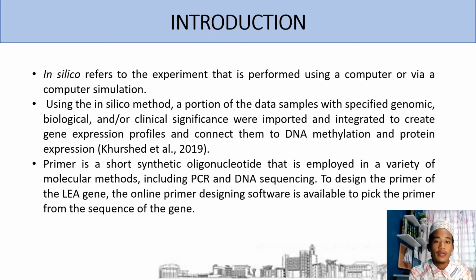How about primer? Primer is a short synthetic oligonucleotide that is employed in a variety of molecular methods, including PCR and DNA sequencing. To design the primer of the LEA gene, online primer designing software is available to pick the primer from the sequence of the gene.